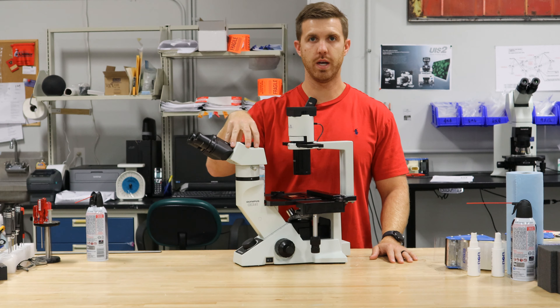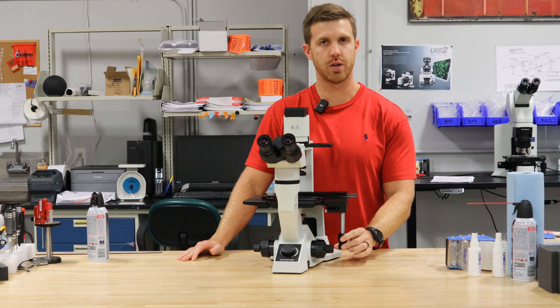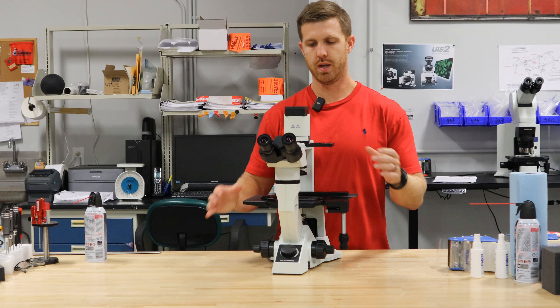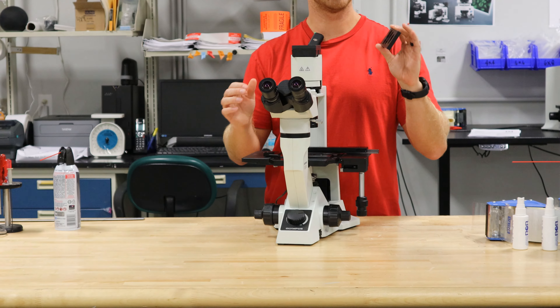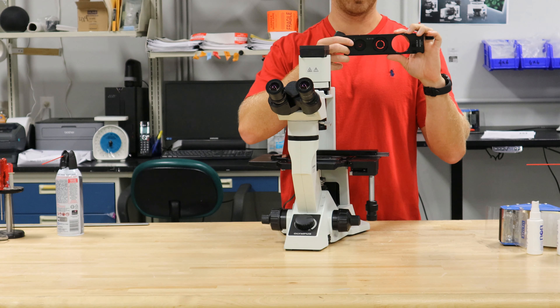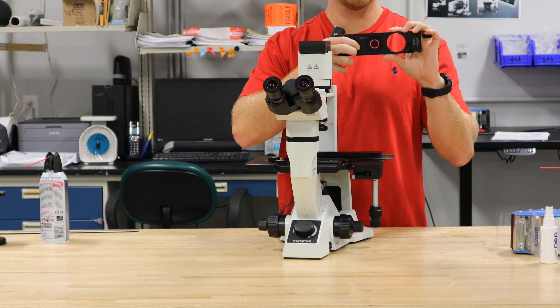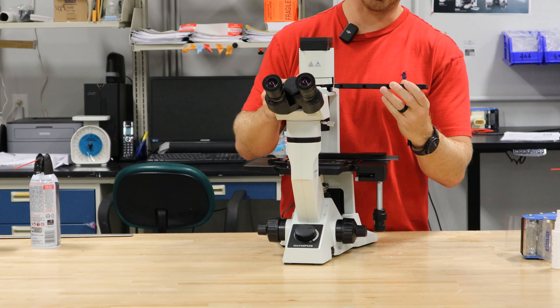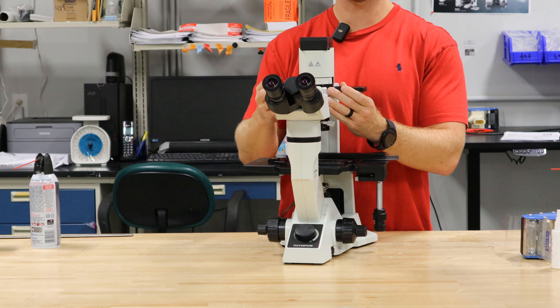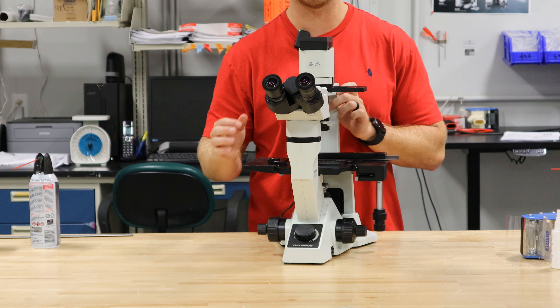This one also has a right-handed stage drive, so it has good X and Y movement. And the phase slider — this is very important. It has a couple different phase rings in there: one for the 4x, one for the 10x, 20x, and 40x. And it has an open spot for brightfield. It has click stops so it makes sure it's pre-aligned and preset to the area you need it to be.